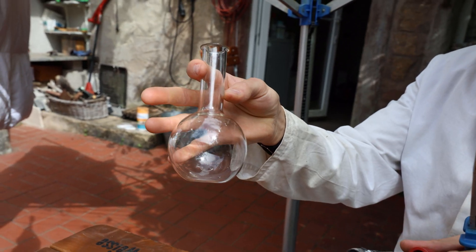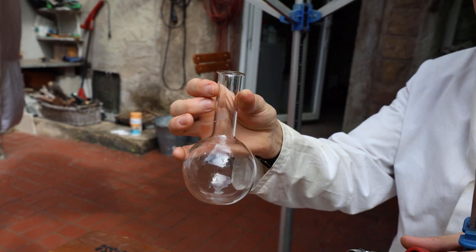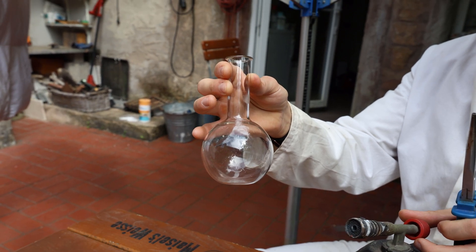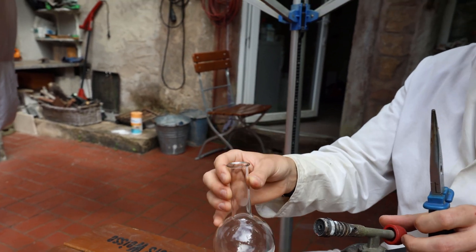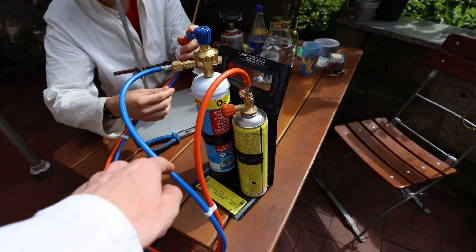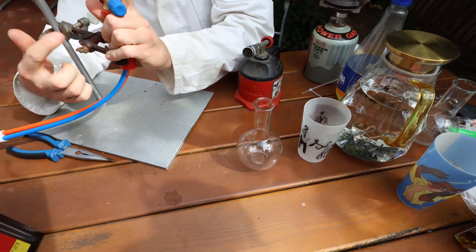This is the flask that we are going to store the bromine in once it's done and we will decrease the neck size a little bit. Heck yeah that's what we need, an oxygen burner, because this glass is way too thick for that.